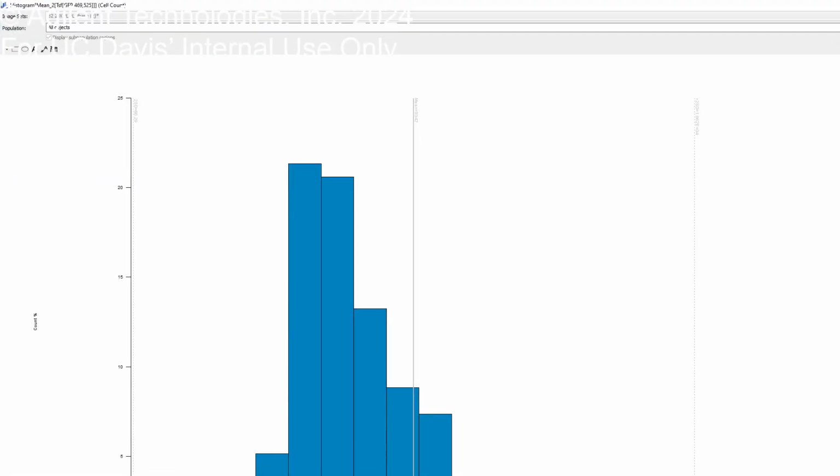And then we can also get these populations. We can see there are some that have relatively lower expression of GFP, and some where you can see a good separation from here to here. Maybe we want to distinguish between these two populations and call it a new pop.